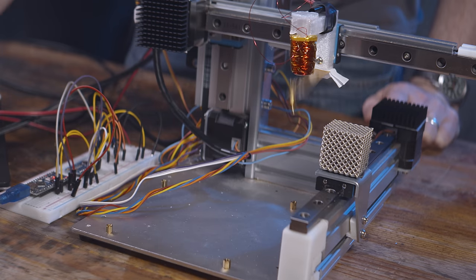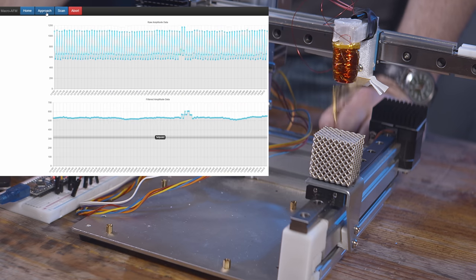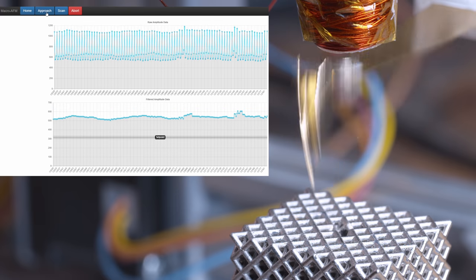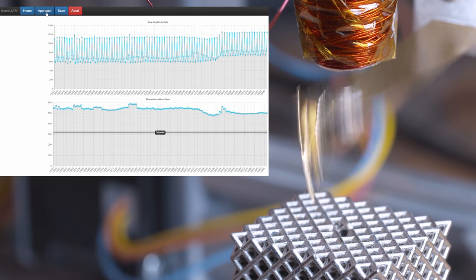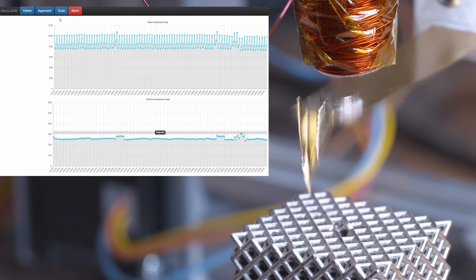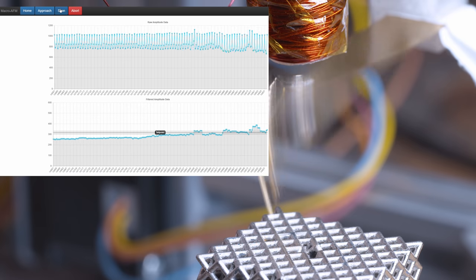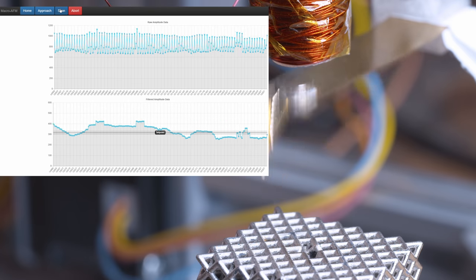So let's see this in action. If I go to the UI, I can get everything lined up. Now we're roughly in position and the AFM can approach. What it's doing now is it found the set point — essentially 60% of the oscillation — and that's where it's going to try to get to. It moves into position; you can hear it starting to tap. The chart shows we get under the set point, so we're roughly in position and can start the scan.